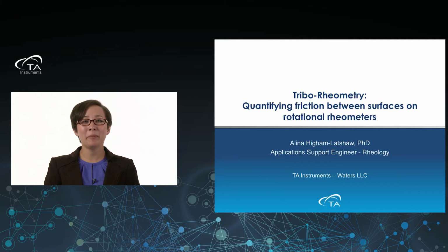Thanks, Dave. Hi, I'm Alina Latshaw, and today we'll be talking about tribo-rheometry, a way to quantify friction between the surfaces of your rotational rheometer. In this presentation, we'll be discussing the theory behind tribology, introducing the Tribo-rheometry Accessory for the rotational rheometer, and then going through a few case studies that we've performed in-house and discussing some of the data that we can get from these types of tests.